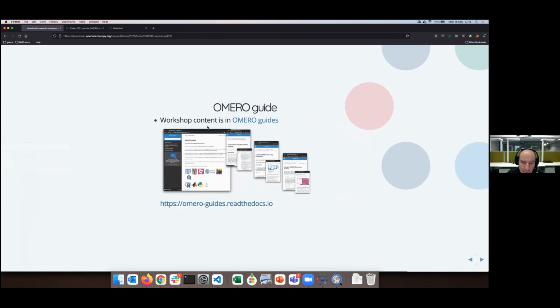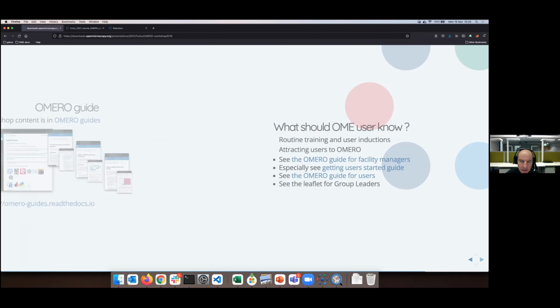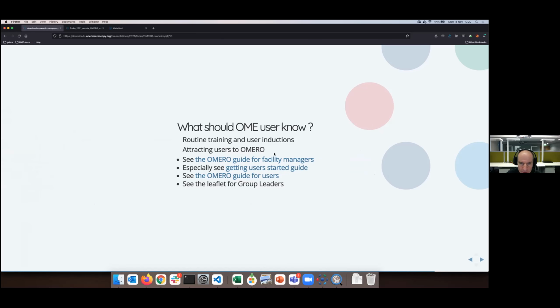The content of today's workshop is captured in full in so-called OMERO guides. This is documentation in a workflow type, and we will use it again mainly as we go. This is for you, and mainly for people like Joanna.